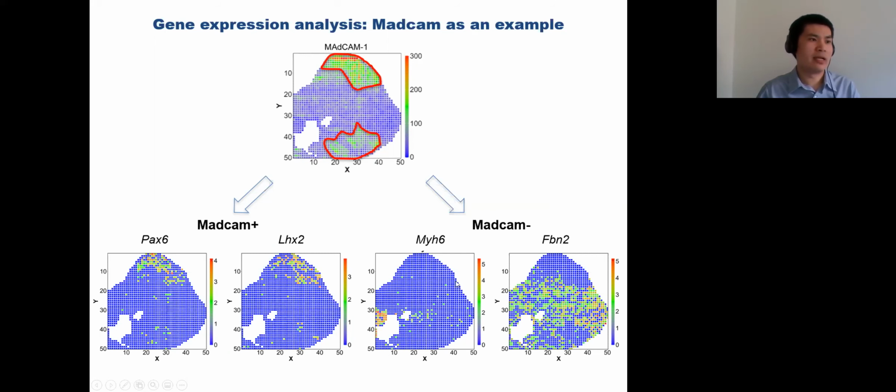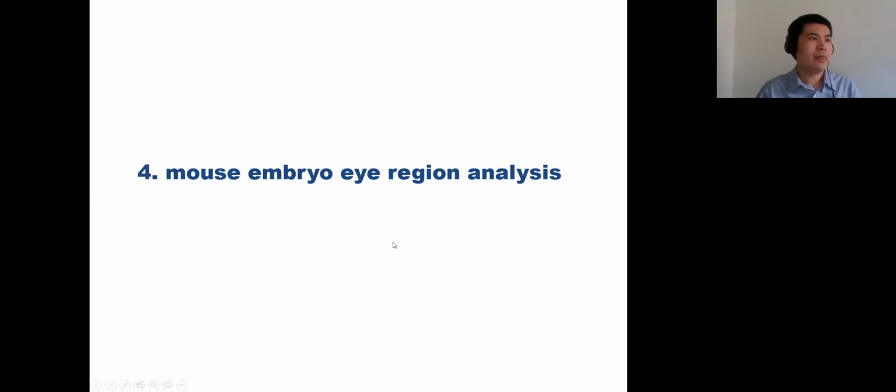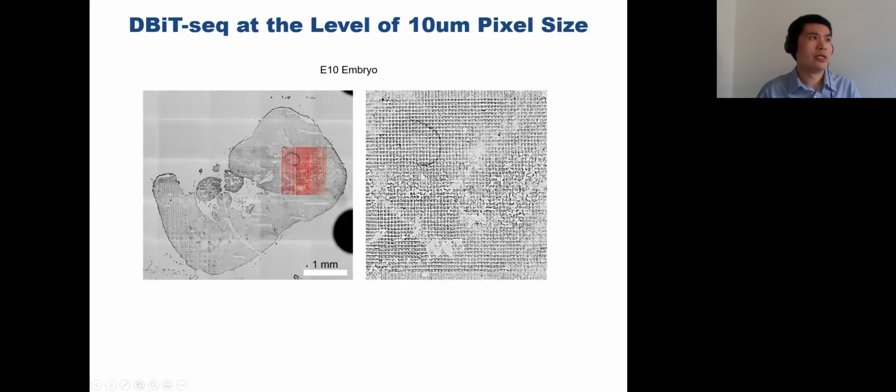So basically, it can give us an understanding of the influence of protein expression on RNA expression. So this is kind of showing another power of the technology. Then I go to the highest resolution of our technology. It's a 10 micron resolution process.